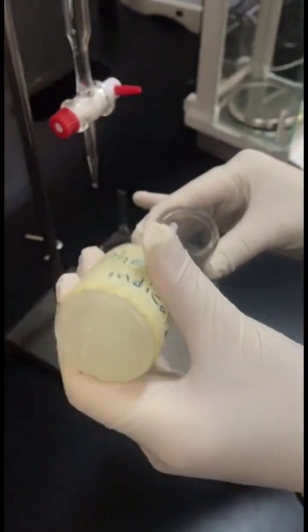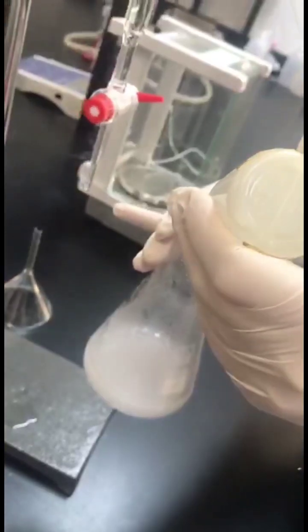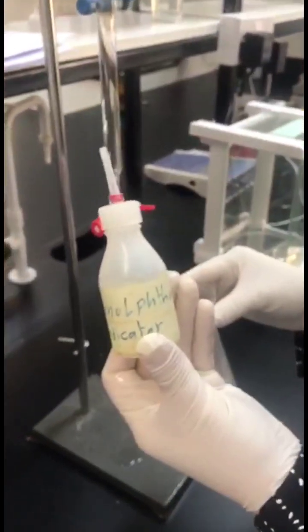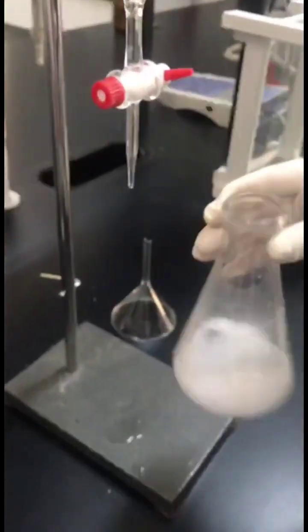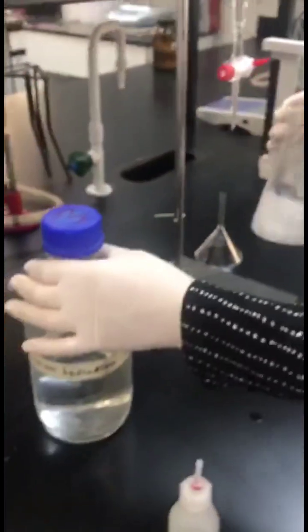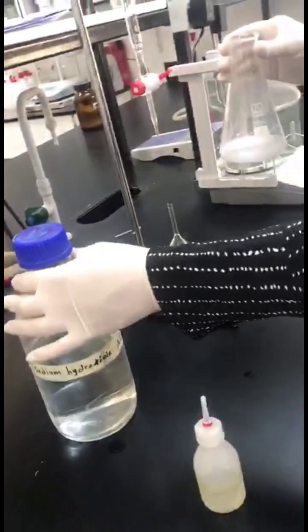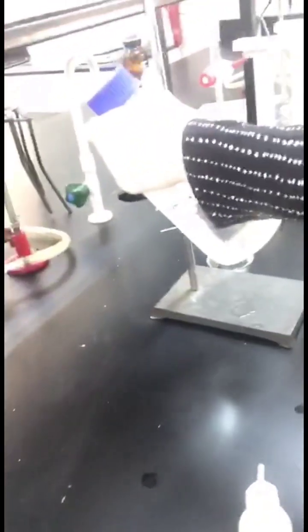After cooling down our sample, we will add 3 drops of phenolphthalein indicator and titrate the HCl excess which is present in our sample with NaOH.